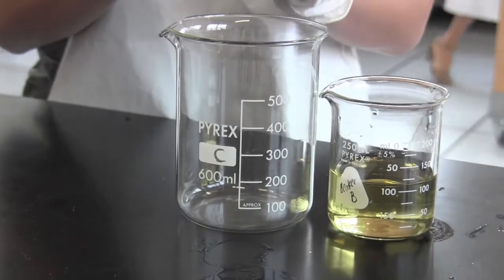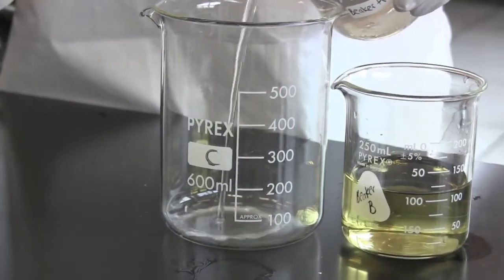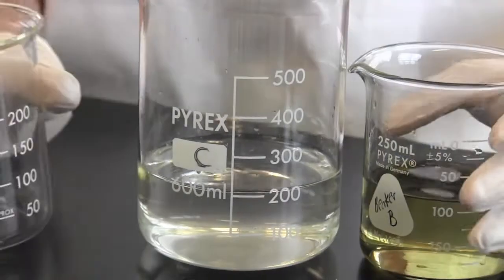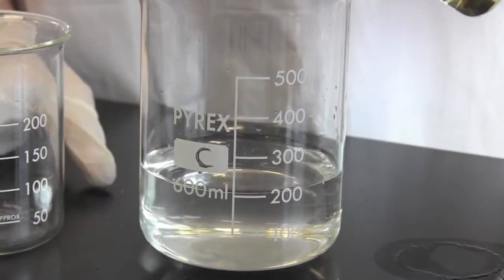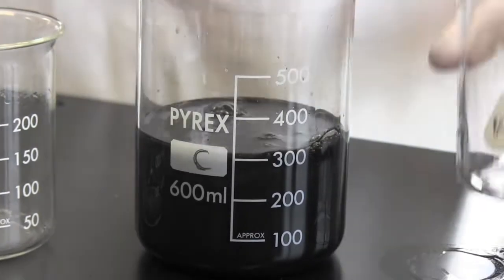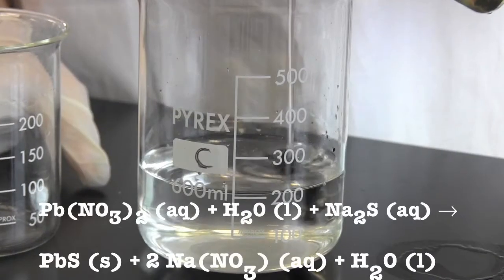We then combined beaker A and beaker B into beaker C, and a precipitate formed. A precipitate formed from sodium sulfide and lead 2 nitrate. The precipitate was lead sulfide.